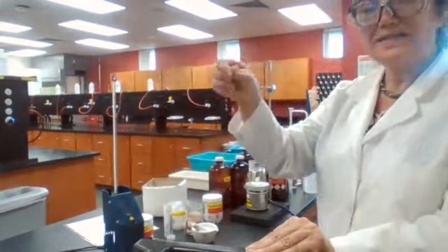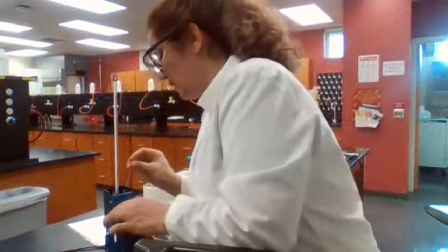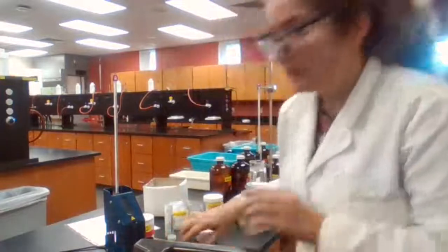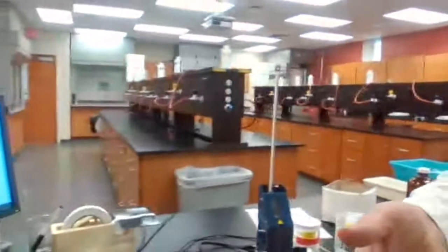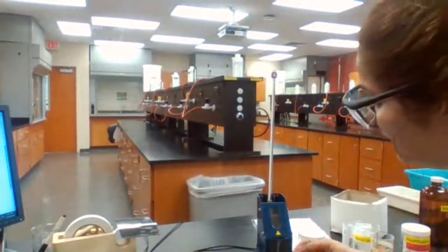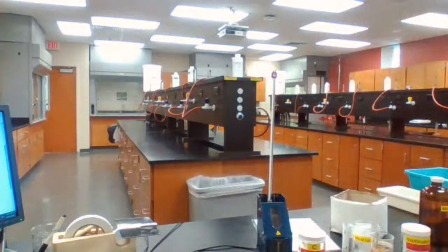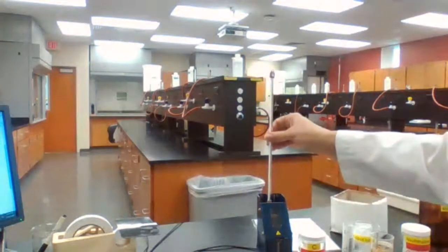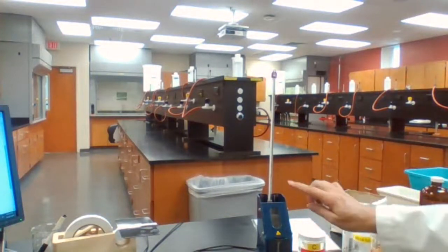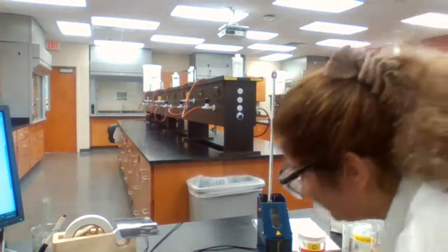We can start the melting point of the unknown at this point. For the melting point of the unknown, I place the sample and turn on the melting point apparatus. Okay, you see, wait until it is melted. So it's at 60 now. It dropped because it was off for long enough. It went down, now it's going up. And as soon as it melts, I will show you.